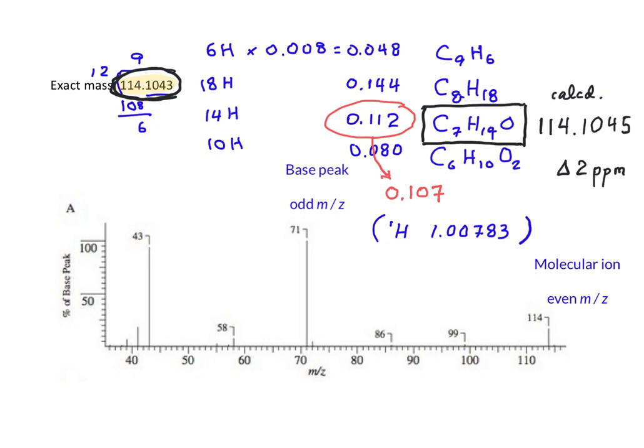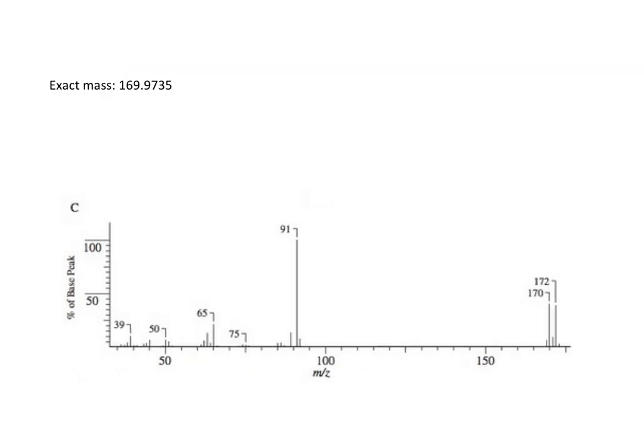Let's try one that's a little bit more complicated. This spectrum is for a compound that has an exact mass that is slightly below the integral value of 170.